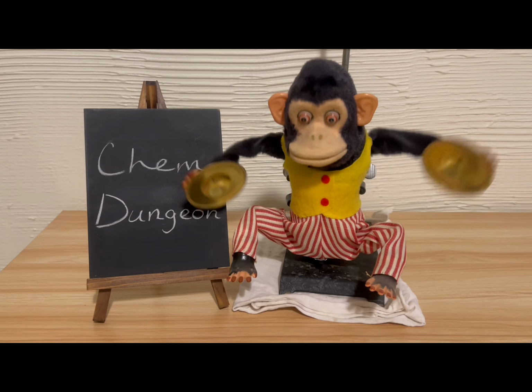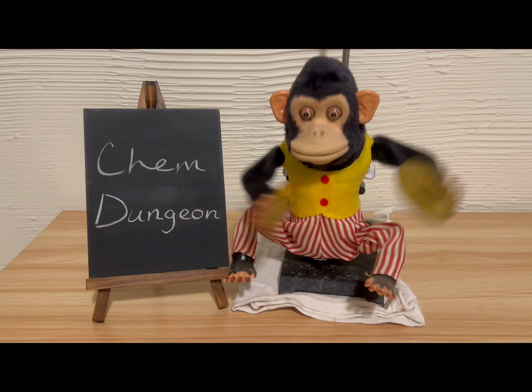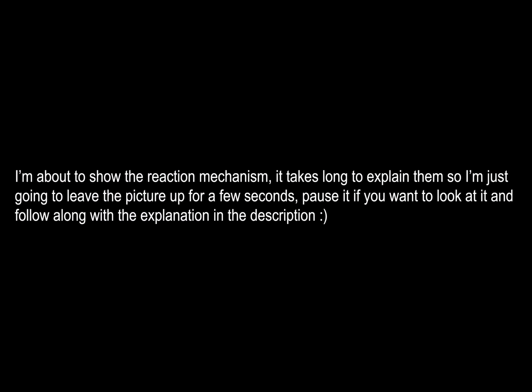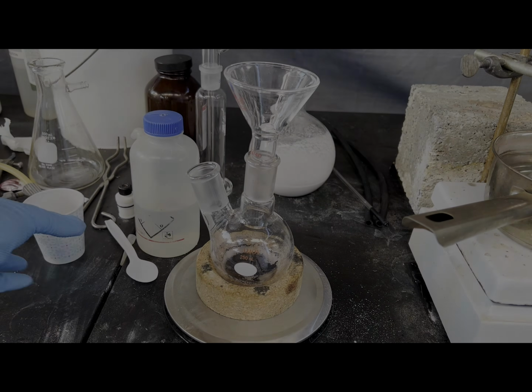The procedure that I'm basing mine on used sunlight as a source of UV light because it's from 1947, I want to say. And they basically bubbled chlorine through the reaction mixture for a day in the summer or 2 days in the winter. Enough yapping, onto the video.